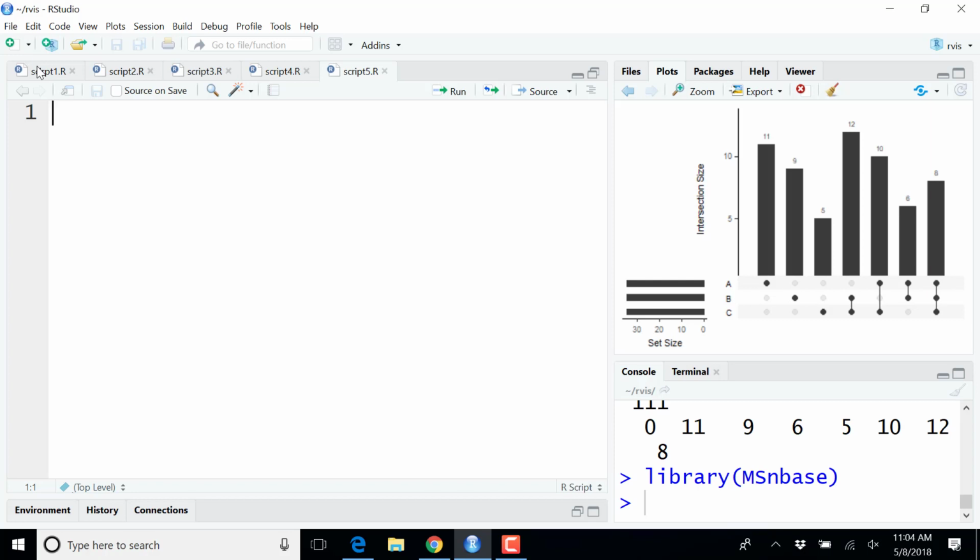Now I look at all my pairwise distances, 2 and 4, 1 and 4, 1 and 3, 5, and so on. The next pair of samples that are close to each other are 2 and 4. So I have my next cluster here, 2 and 4. And probably the center of this new cluster is somewhere here.